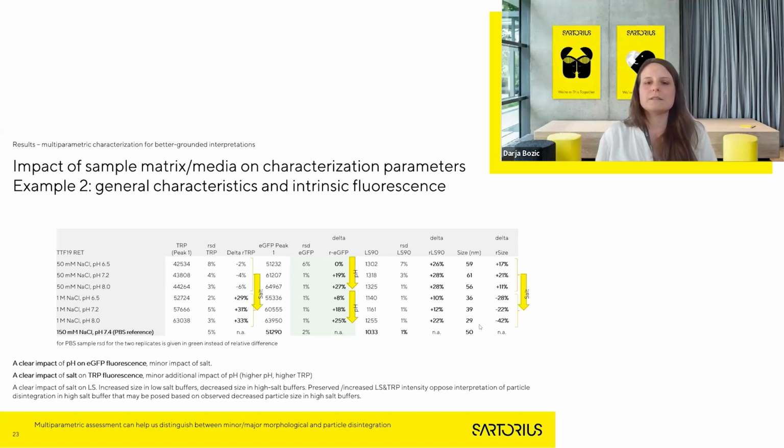This is, I guess, one thing that could be assessed by this methodology. And my guess would be that the stability of the EVs with respect to pH would depend on their source. So it's hard to define a range without better knowledge about what samples we are talking about.